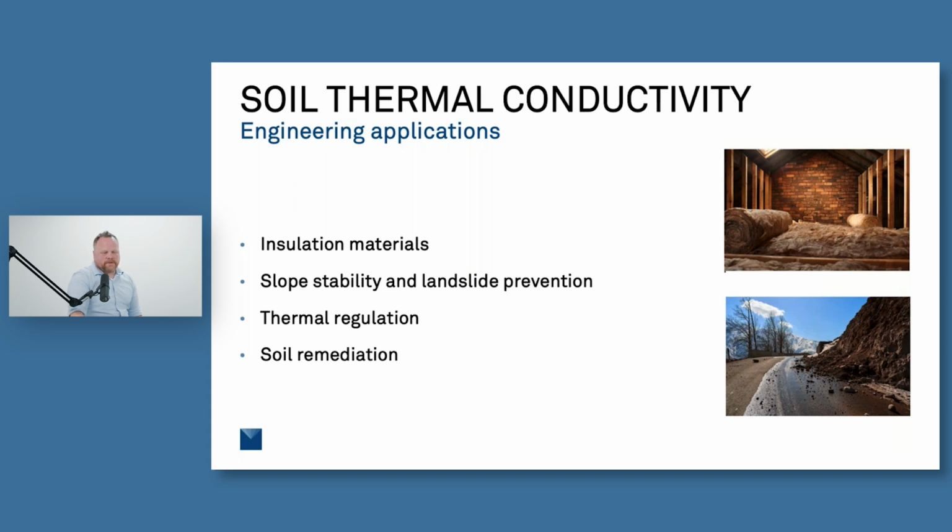We've done a lot of research as well and collaboration with people that are researching slope stability and landslide prevention. And we're starting to understand better how thermal conductivity of those soils can affect the slope stability as things freeze and thaw. It can cause that stability to change, and that's going to change based on how well that soil can conduct heat, primarily with the moisture level in that soil.